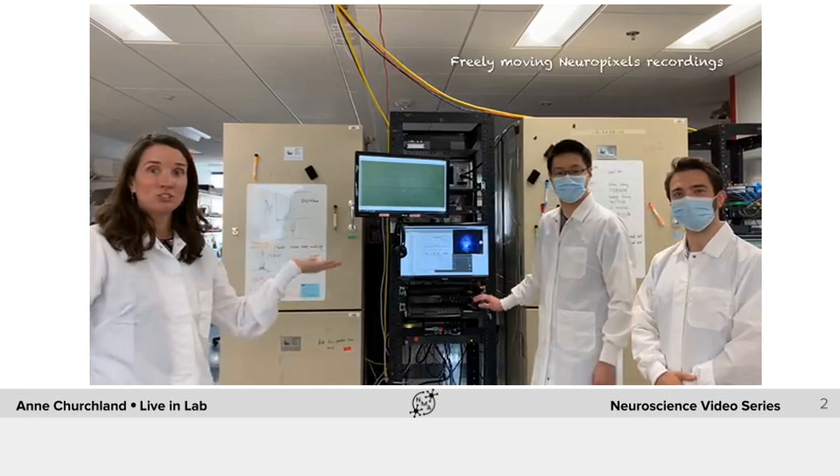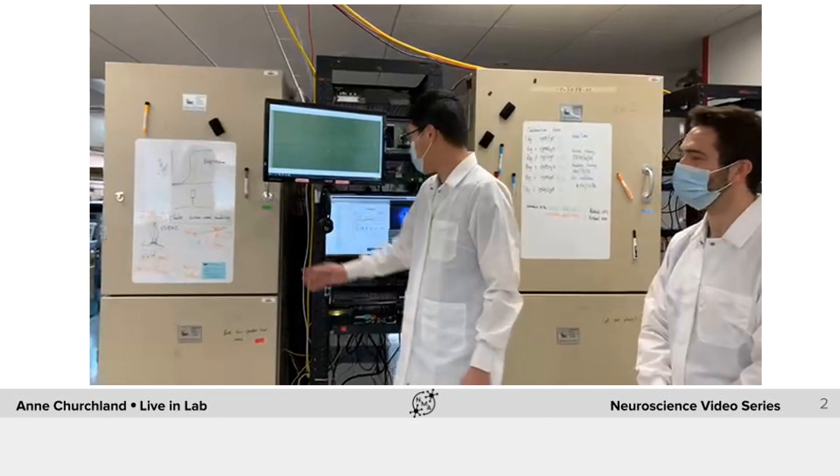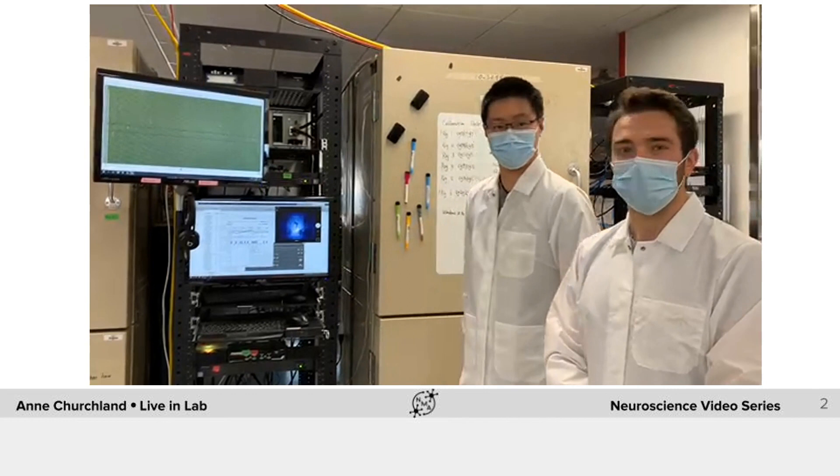We'll start over here where two students in the lab, Chakshun and Alex, are doing an experiment to understand the neural responses that support decision making. So when the animals are doing the task as you can see in these boxes, at the same time we are using the Neuropixel system to do the ephys neural activity recording and you can see here on this monitor there are some neural spikes that we got from the animal.